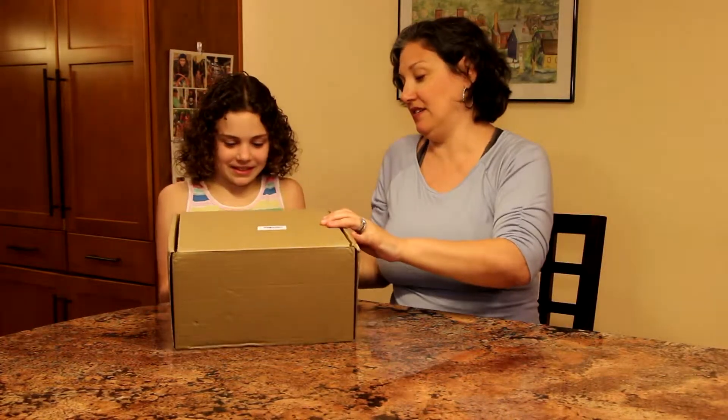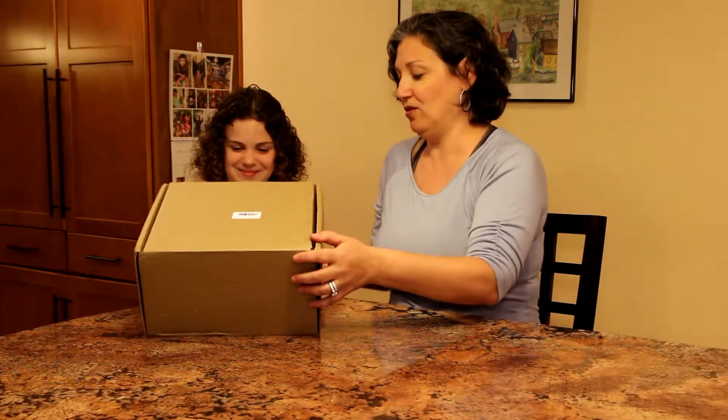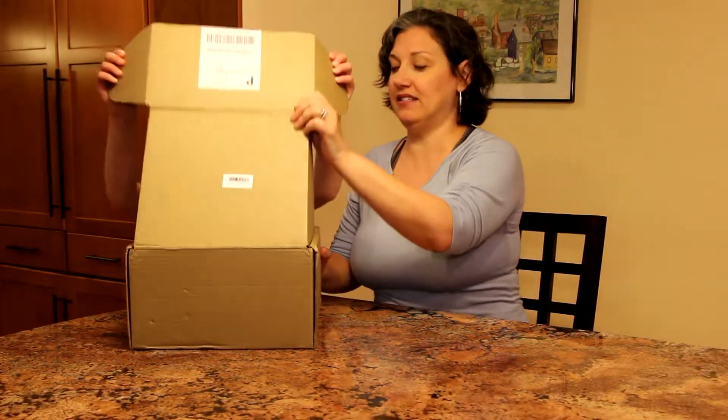Want to help me open this up, Liz? Alright, let's see what's inside.